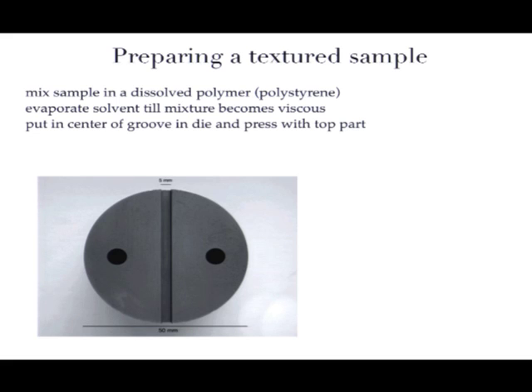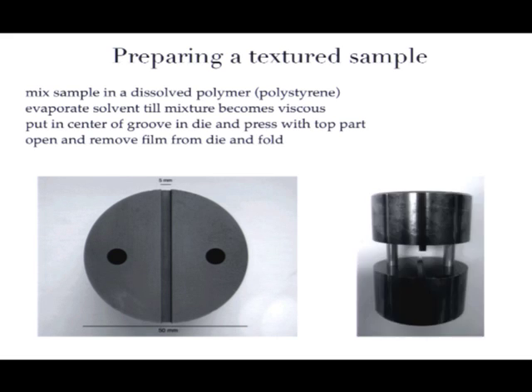the groove of some die which we made like that. So we put your sample in here, and then pressed it with another one here to make a film out of the polymer mixture. Originally, we thought we had to do very high pressure, so it's a very robust cell. It turns out it's not necessary to have really such a high pressure.